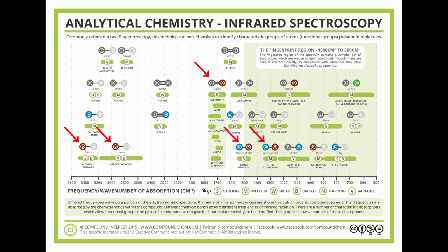Now, when I see an oxygen in the molecular formula, and I've been given the infrared spectrum, I'm going to look for what kind of functional group that could be. The frequencies associated with oxygen-containing functional groups are usually easily identified. And if we look at the infrared spectrum, we see this broad peak out here at about 3,500 per centimeter.